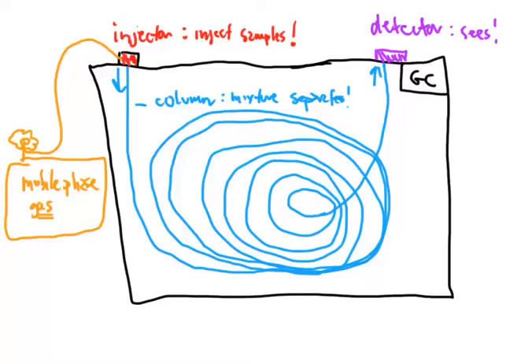If there was no gas present, you would inject your sample into the injector and it would stay there. It wouldn't want to migrate very easily through this 60 meter or 100 meter column and out the other end. It's just not going to do it. You need something there that will push the sample through the machine from beginning to end, so you don't have to stay here for days on end waiting for your sample to come out. Right? So that's the mobile phase, which is really just the gas tank. That's all that it is.